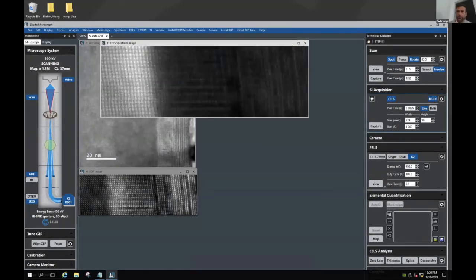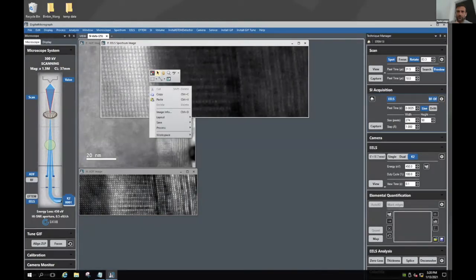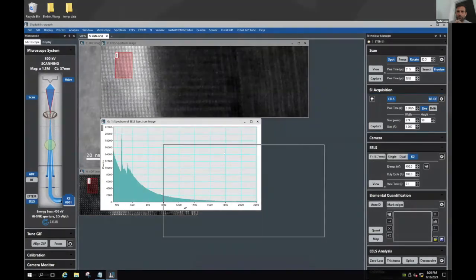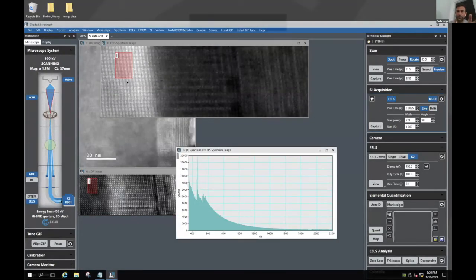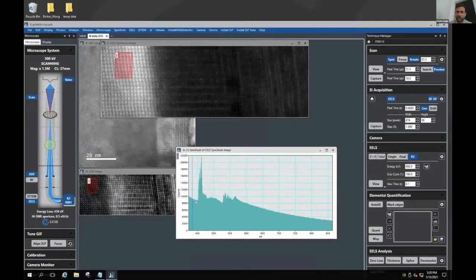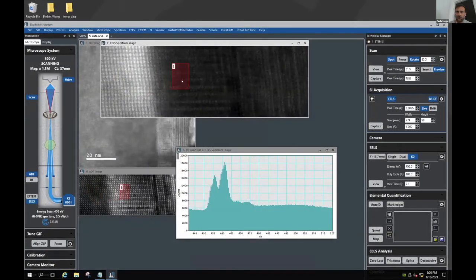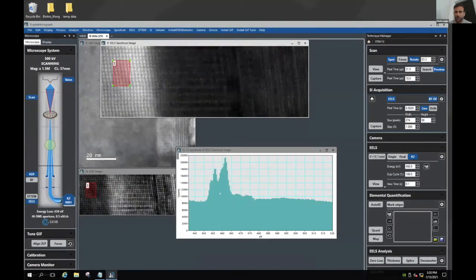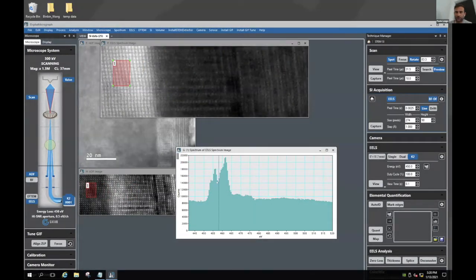So right click, you see there was a little bit of drift. This is the spectrum image, okay? So this is the STO. You see that at least down to the background level, it's atomic. So we have already pretty good energy resolution. Things are changing a little bit there. On the titanium, perhaps the crystal is changing. But you see pretty much everything. What about the oxygen there?